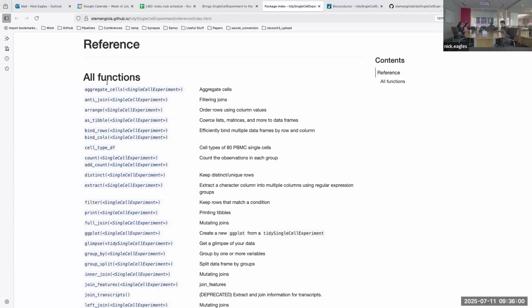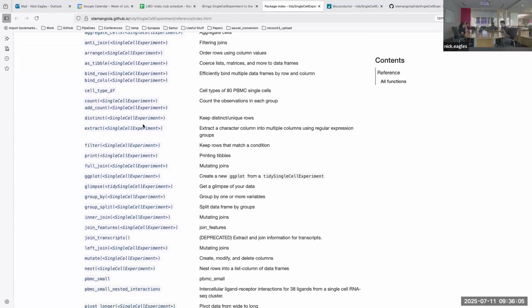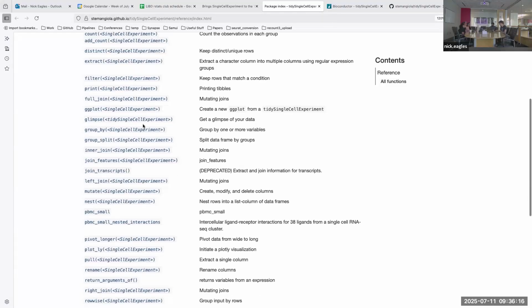This is a little bit different in that they do have to explicitly define each function. And so you might think, well, what if they don't define it correctly? I guess that's technically possible. But I think in this case, it's a little easier to define these functions.